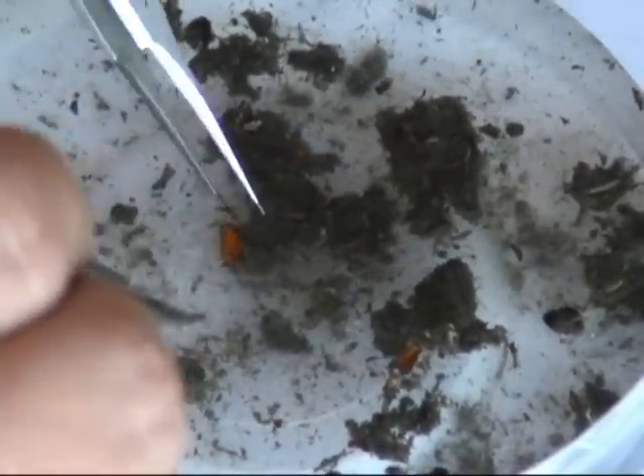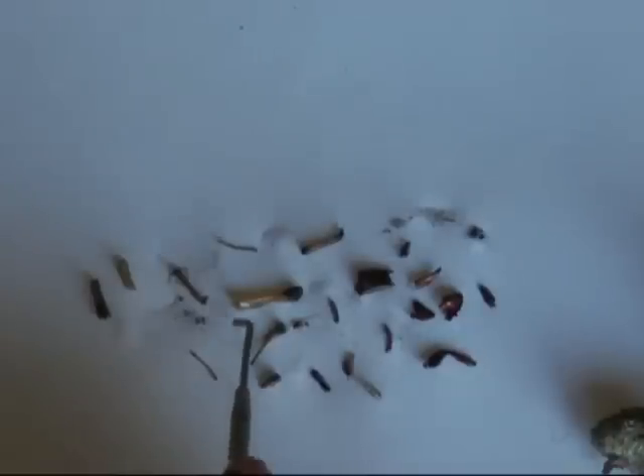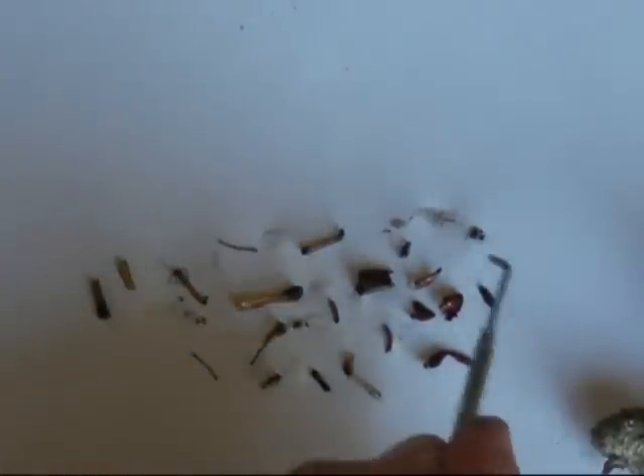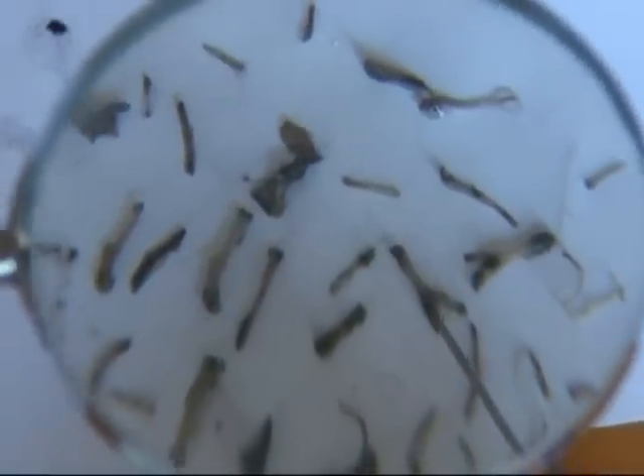This looks like we've got a leg of a beetle. Place each piece onto paper so it can be identified later. As you can see, there are many bones and insect parts contained in just one pellet. Use a magnifying glass to identify each piece.